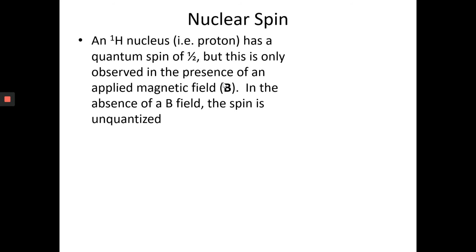So if you don't put your sample of hydrogen in a magnet, those different nuclear spins are just pointing every which way. The plus signs here represent the hydrogen nucleus, the proton, and these arrows represent the direction in which their magnetic moments are pointed. The fact that they have spin 1/2 means that they act like little magnets, only without an external applied magnetic field, they're just pointing all over the place.